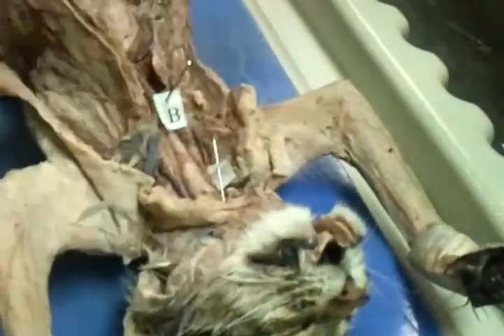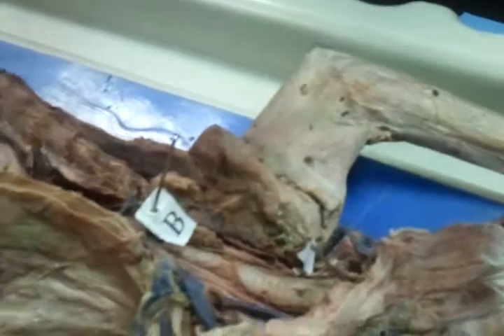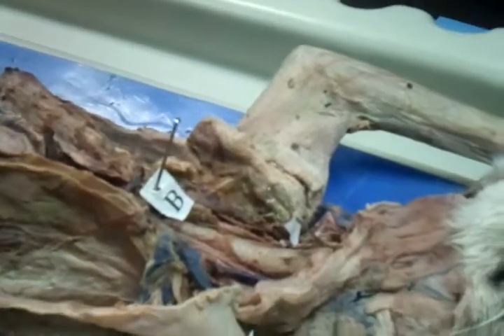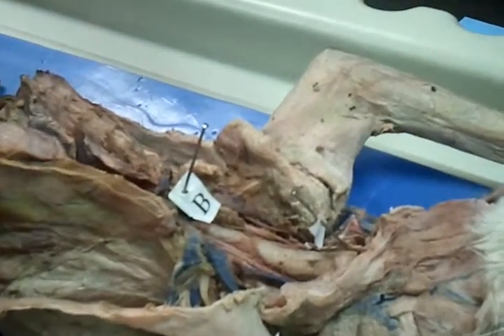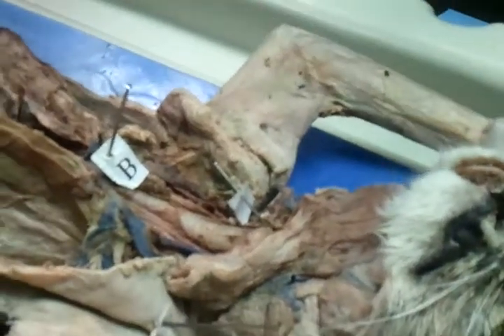Okay, that hard cartilaginous thing at the top of the esophagus. What is that? Larynx. If I had a cat where that larynx was kind of popped off and you looked at it, it had like a little flap. Okay, good.